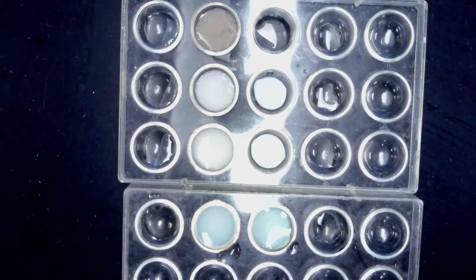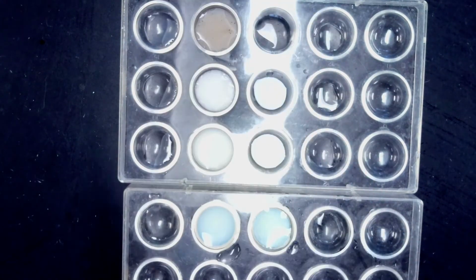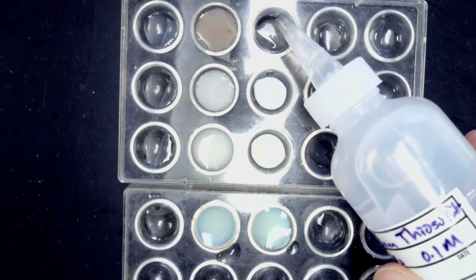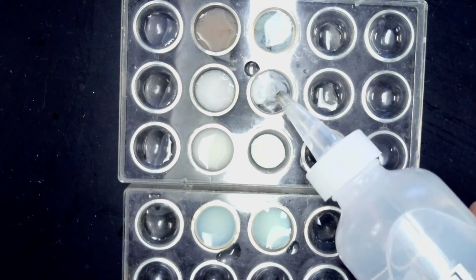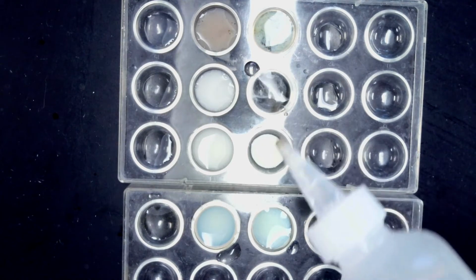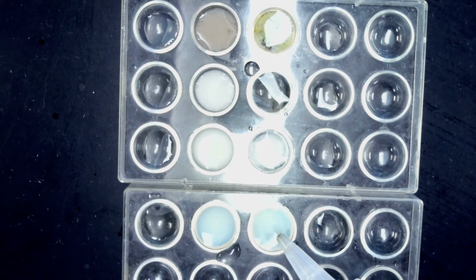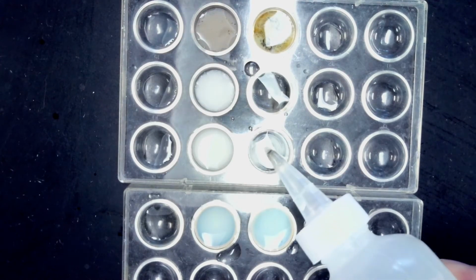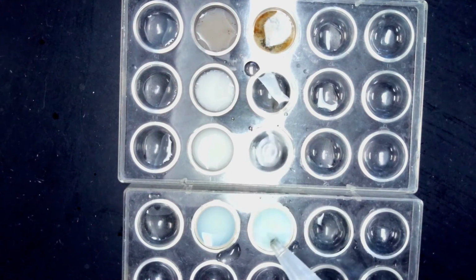Now we're going to add the sodium thiosulfate. And you can see that one clears up. It looks like a precipitate formed in the top one. So the top one, a new precipitate formed. The second one, it cleared up. And the third one also clears up. Not quite as much. It took a little more, but it did clear up.